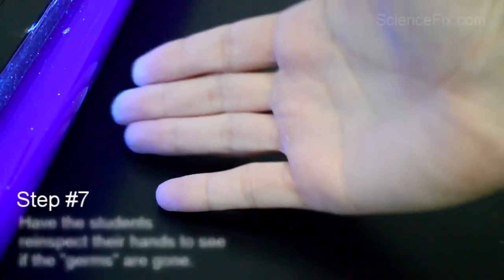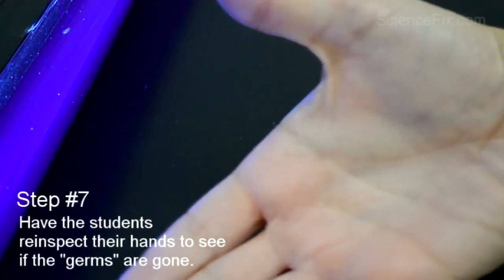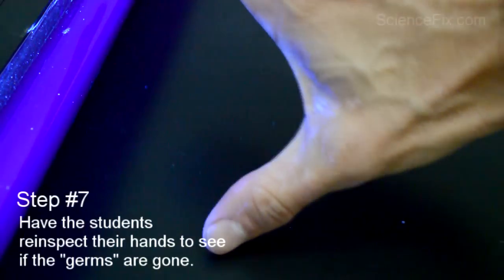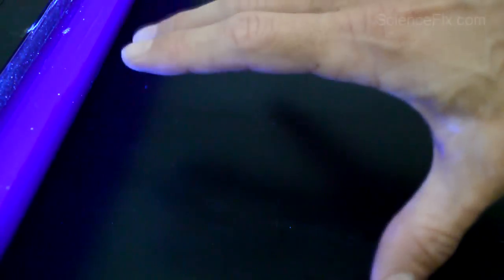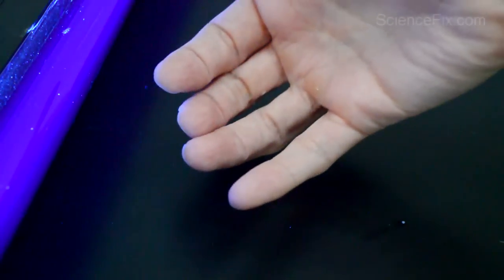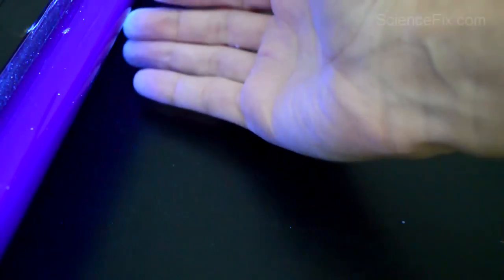Now washing their hands is pretty important if you run a chemistry lab. You don't want any of the chemical residues left over. And also if you do some dissections, you don't want any formaldehyde, or maybe if you're doing like chicken wings, you don't want the salmonella left over. So this shows them why it's so important to wash their hands.